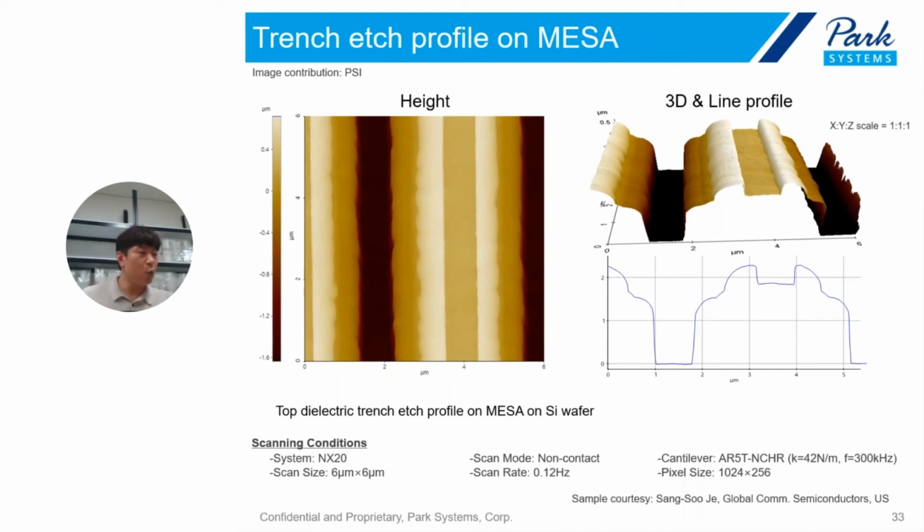Well, it is not surprising that we can perform complex or complicated structure monitoring using AFM. Like this sample, a trench profiling method, we can image the trench structure with this 3D image and this line profile. Micro or nanoscale, broad or steep structure, it's not a problem. We can perform all the types using AFM, and we can also investigate some quite complex structures.